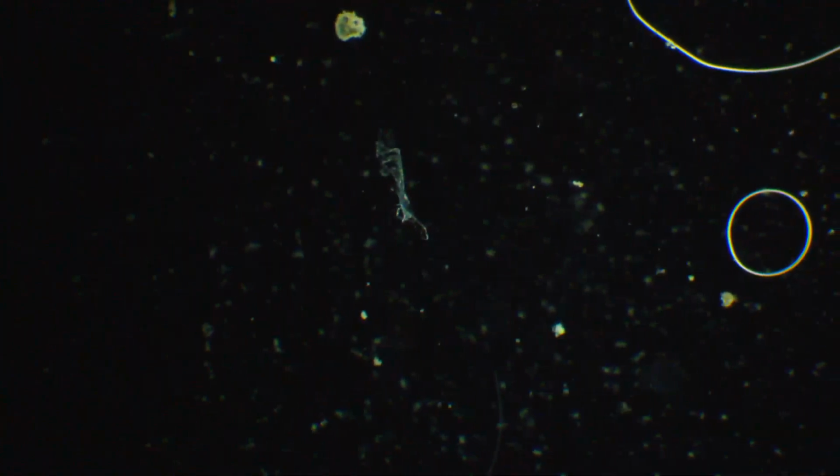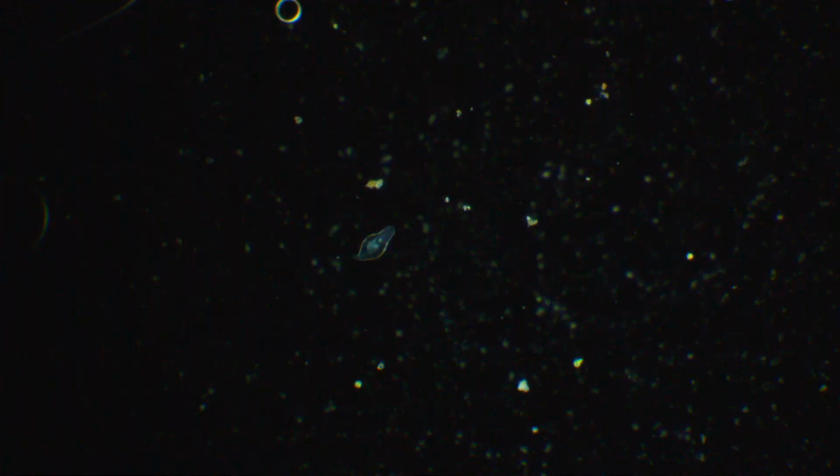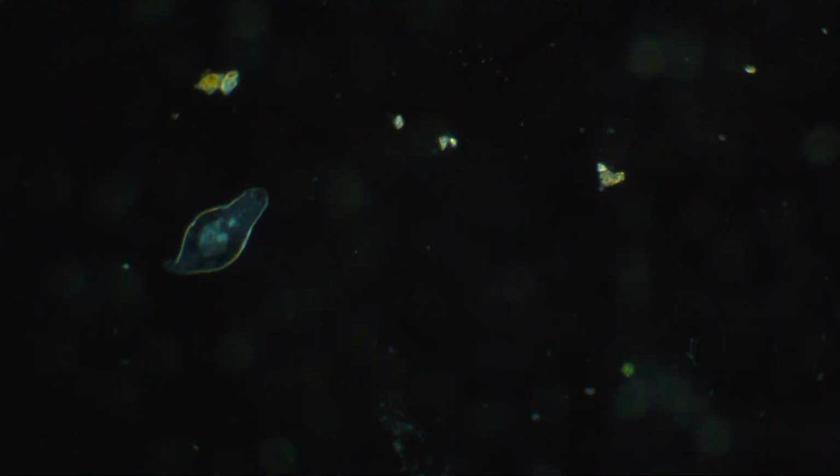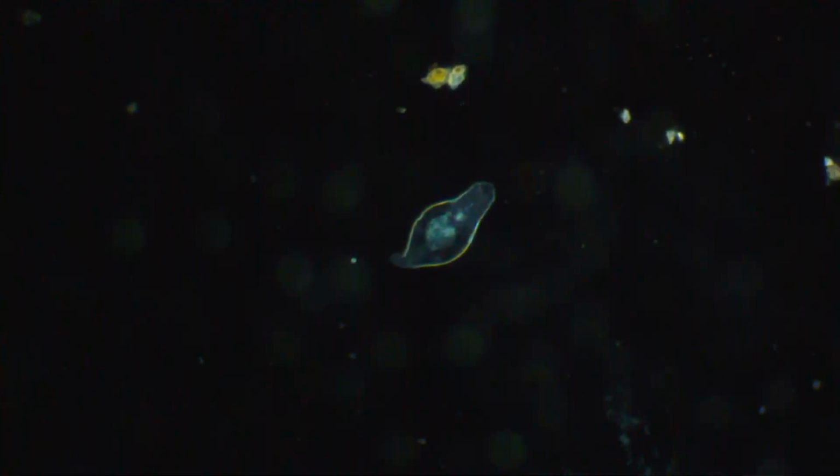So I'm just scanning through this slide here to see what else is in here. And then we're going to look at some different samples. Oh, look, Mr. Rotifer. What's up, Rotifer? Let me go back out and center him up so I can get him on the third objective here. There we go.